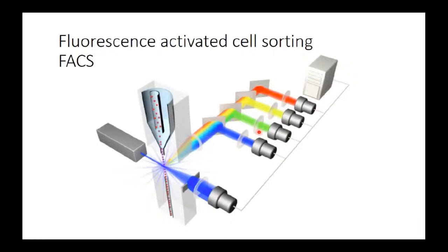We can also combine the data together. So I can form this two-dimensional histogram again, but with protein 1 and protein 2. So I have signal coming from fluorophore 1 and fluorophore 2. When the cells are here, it means that these cells are expressing both proteins, because they are giving high signal on the first detector and on the second detector.